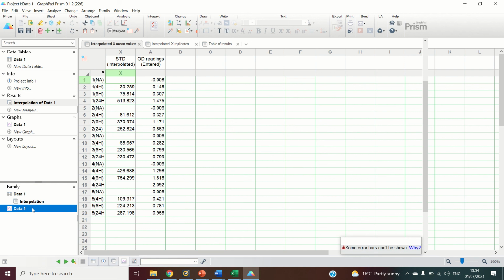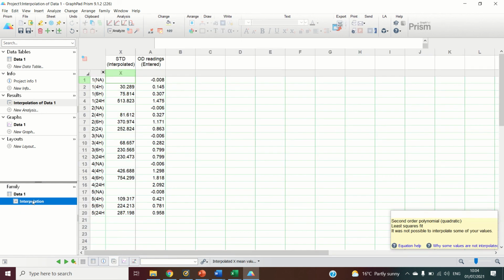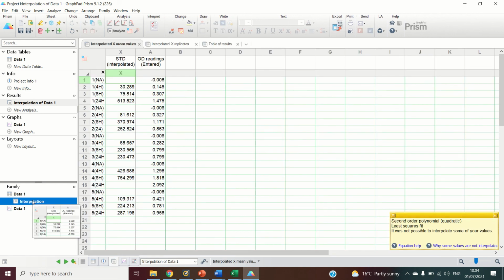I've got my standard curve, I've got my values, concentrations, and now I will move to try to analyze my data. For the type of my data, because I have different experiments and each experiment has different conditions, which are different times of incubation with the treatment, for this instance I think I will use one-way ANOVA.